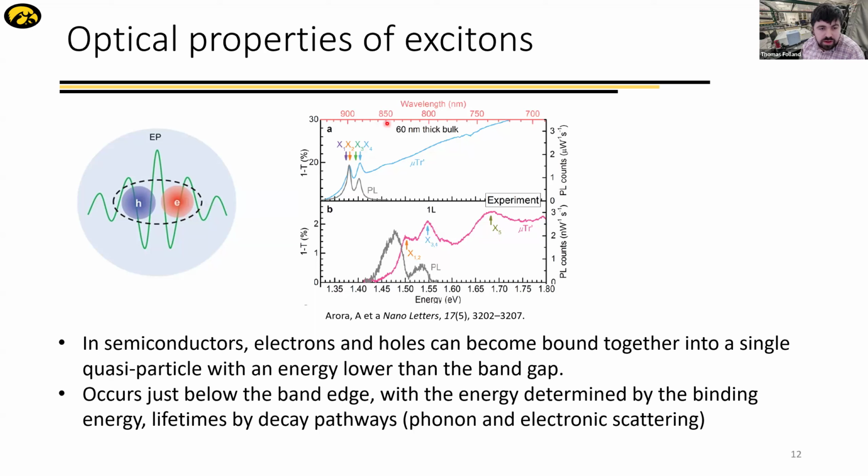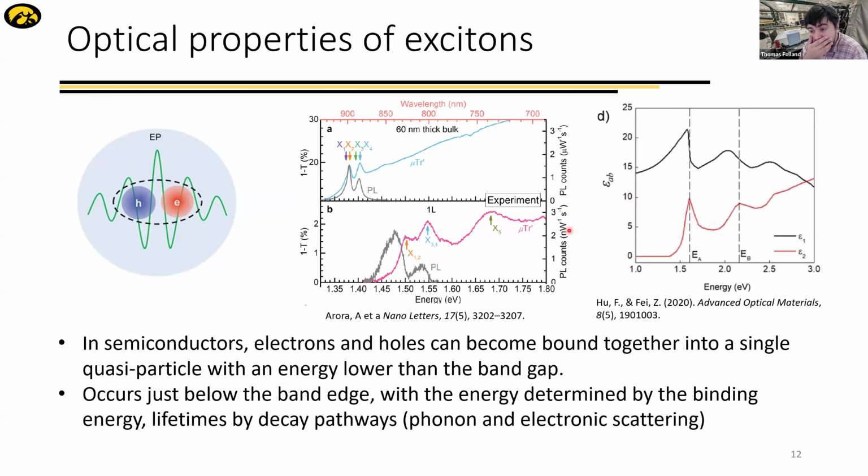This is actually for the transition metal dichalcogenide, rhenium disulfide, which I'll talk about a little bit later. And again, we can build an optical constant model. These typically involve Lorentz-type oscillators, which we combine together to make these optical constants. This tells us about the energy, and it tells us about the line width.